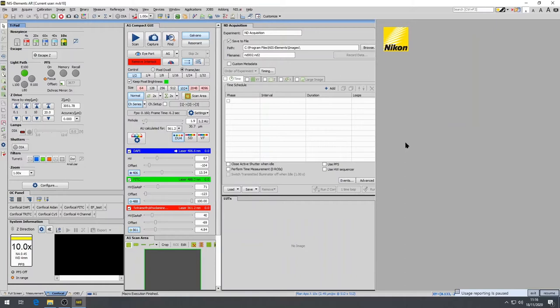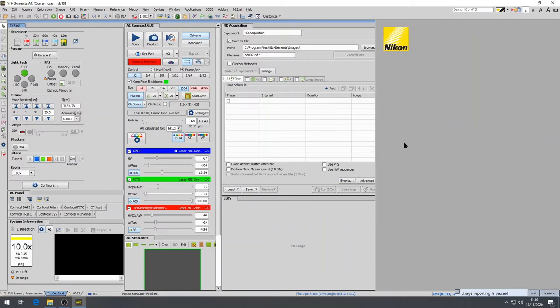The Nikon Elements graphical user interface appears to be much more intimidating than it really is. There are many buttons that can be pushed and many options that can be selected but most users will interact with a subset of these possibilities and it can be broken down to these main windows. On the right side is the image viewing panel where the required images will be shown just below the Nikon icon.